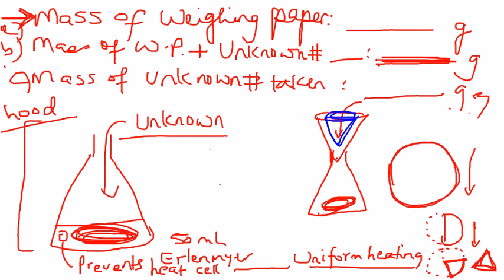And what you will then do is, if you don't actually use the solvent to hold it, it is going to fly away. So whatever was your solvent of choice, let's say it was toluene, I want you to add just about 1 to 2 milliliters of the solvent onto that filter paper, so that it sticks to the funnel and doesn't fly away. And when you're ready, pour down your Erlenmeyer flask, pour your liquid through there.